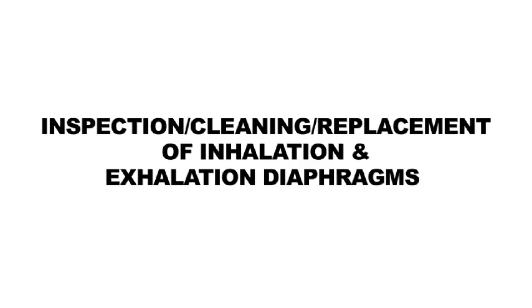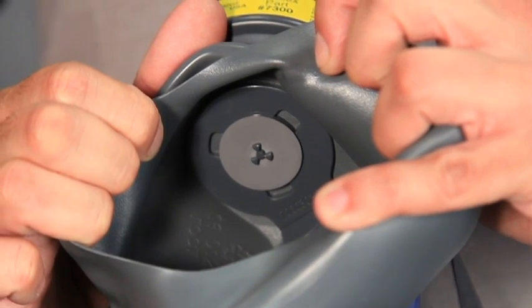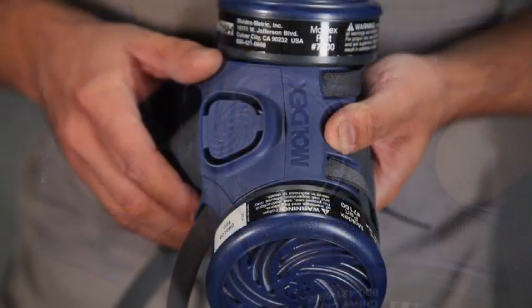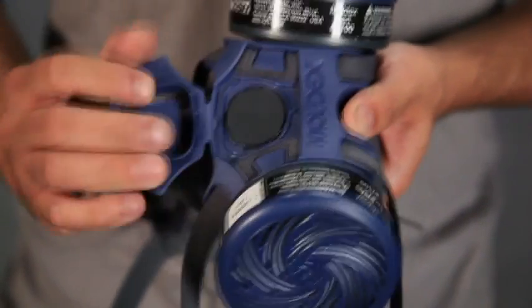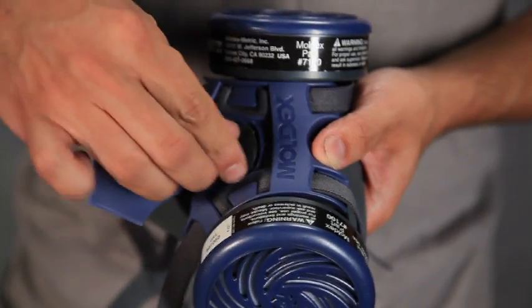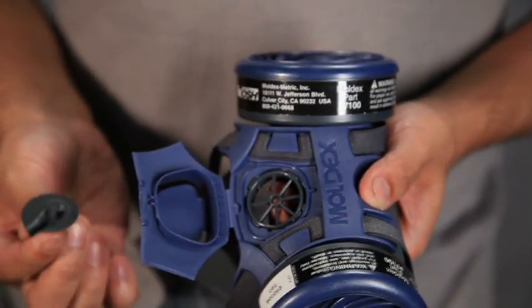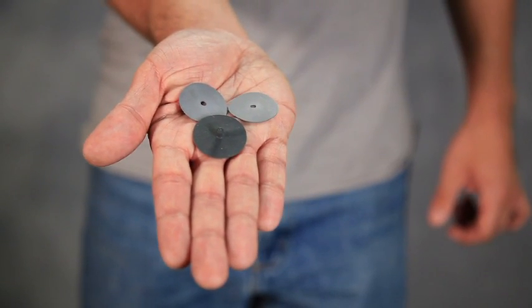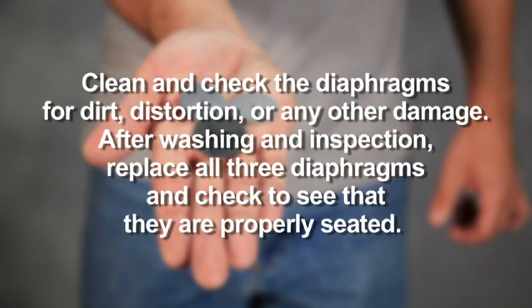Two inhale diaphragms are located inside the face piece and the exhale diaphragm is located under the valve cover. Open the valve cover by pulling up on the latch, then remove the diaphragm. Remove the other two diaphragms and inspect all three. Clean and check the diaphragms for dirt, distortion, or any other damage. After washing and inspection, replace all three diaphragms and check to see that they are properly seated.